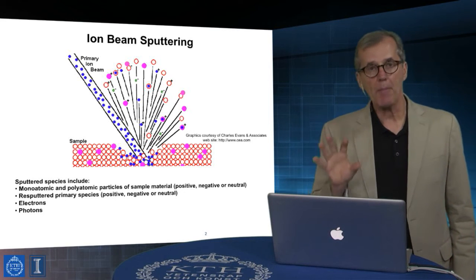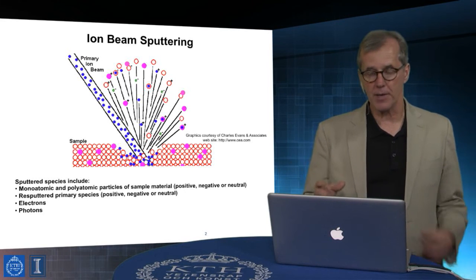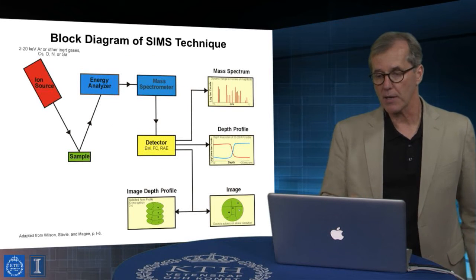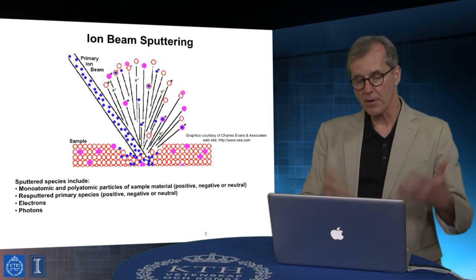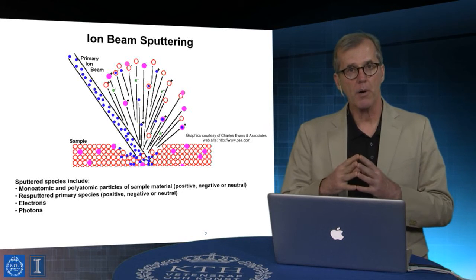So this is a very complex physical process. Ions in, lots of stuff happening. And from that comes a fairly rich outcome in terms of analytical capabilities. Now, what I should have mentioned in the last slide, and I'll go back to just to pick up again, ions are a charged particle.